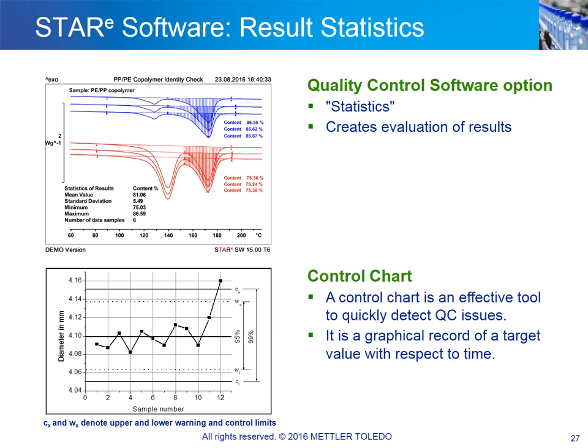The results obtained can also be exported to external software where more advanced statistical evaluations can be performed. One such example is shown in the lower left corner, where a control chart is plotted. Any unexpected deviations can immediately be detected and corrective actions can be taken.